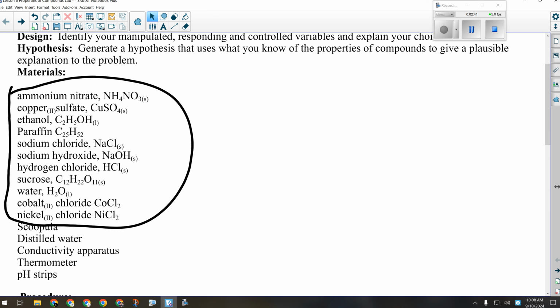And then for the solubility test, you shouldn't be stirring that stuff for more than a minute. If it hasn't noticeably done something in the way of dissolving after 1 minute, it's simply not soluble. I had some groups where I'd ask, weren't you stirring that the last time I came by? That was like 10 minutes ago. It's not going to dissolve. It doesn't matter how long you stir it. So give it a minute, that's it.